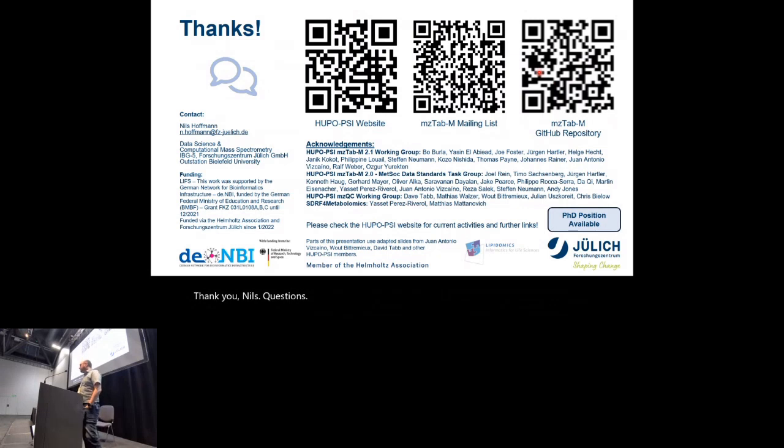Great to see this initiative. Do you have plans to develop some converter tool that can translate the mzTab to more like a machine learning ready format?